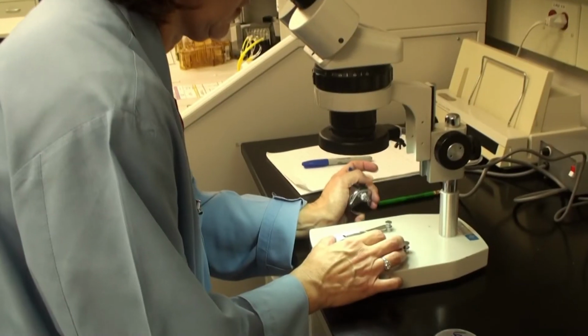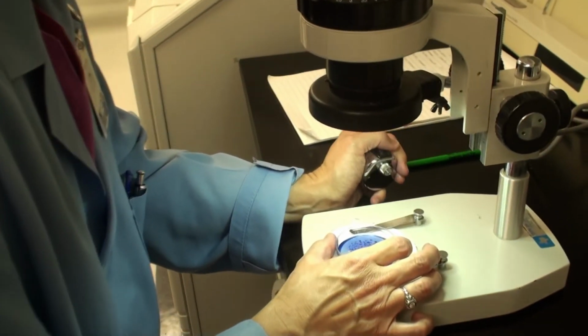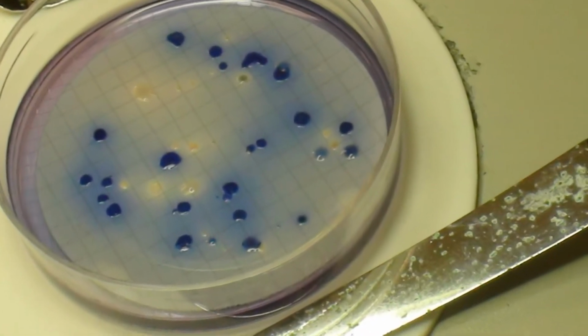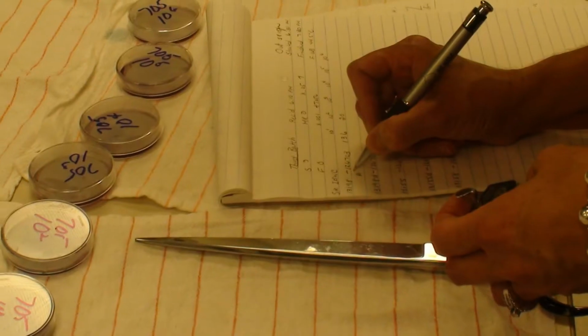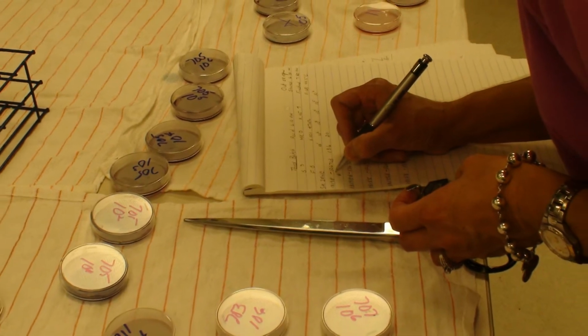After the incubation period, lab staff set out the petri dishes and count the bacteria colonies that grew on each membrane by counting the blue colonies in each grid. Diluted membranes are multiplied by the dilution factor to get a bacteria count per 100 milliliters of water.